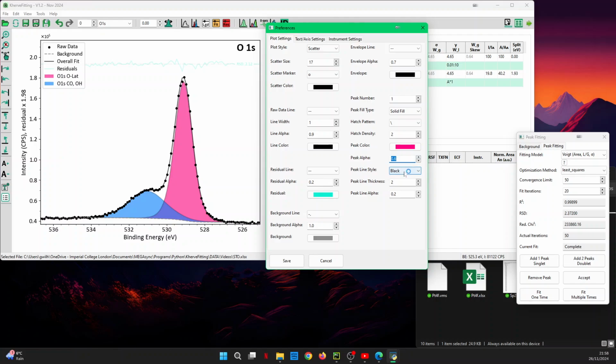Okay. And I can also change the outside of the shape. I can decide to have a transparency, let's say, of 1, just to show what this does. So this is black, same color, so a gray and yellow. I personally prefer black with a bit of alpha, something like that. You can change the thickness. Okay, and let's save that.